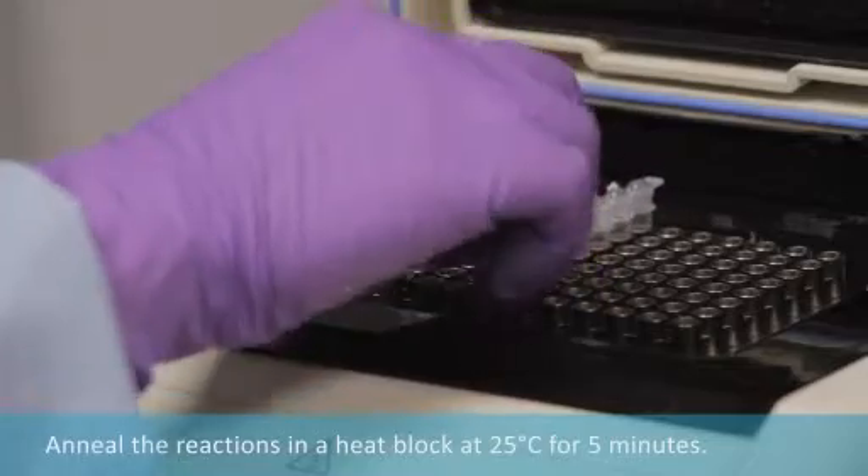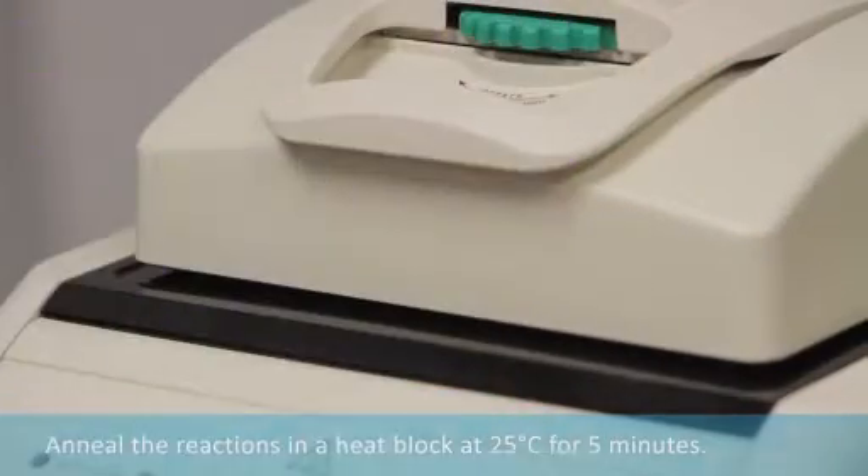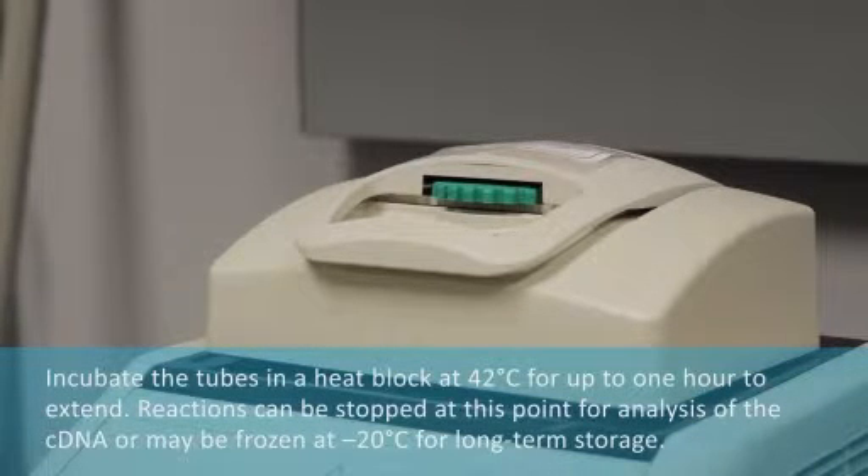Anneal in a heating block at 25 degrees C for 5 minutes. Incubate in a heating block at 42 degrees C for up to 1 hour to extend. Reactions can be stopped at this point for analysis of the cDNA, or may be frozen at minus 20 degrees C for long-term storage.